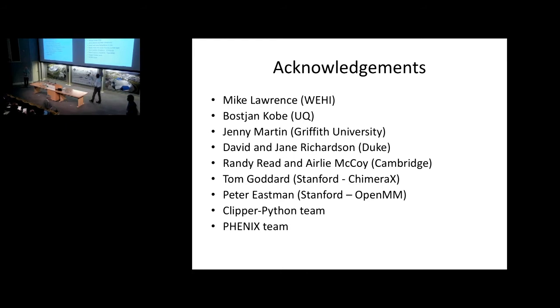So that's where, for example, things like that real-time validation with the Ramachandran plot helps. And one thing I should mention with that, you've got that real-time Ramachandran, so you can say, okay, if I change this, it's improving my backbone conformation. But the key thing to remember is that it will not let you force fit a Ramachandran, the backbone. If you're taking an outlier and putting it into allowed Ramachandran space, but it's still energetically unfavorable, it's going to push itself straight back out. So in order to actually fit that properly, you have to actually do it right. It won't let you do it the wrong way.